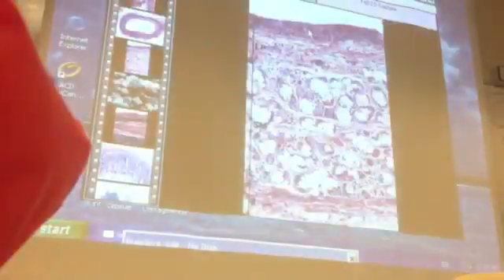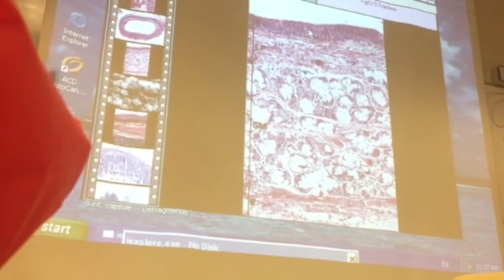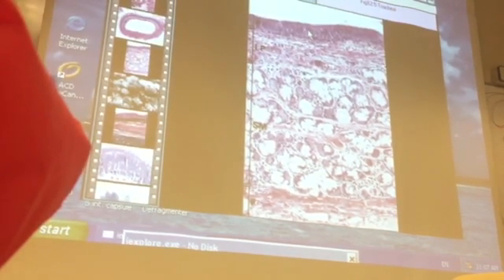This is the only important thing. The rest of the structure you already know. So you remember these types of cells which are present in the epithelium, and this is important. Give me 1 minute. I will bring a marker.